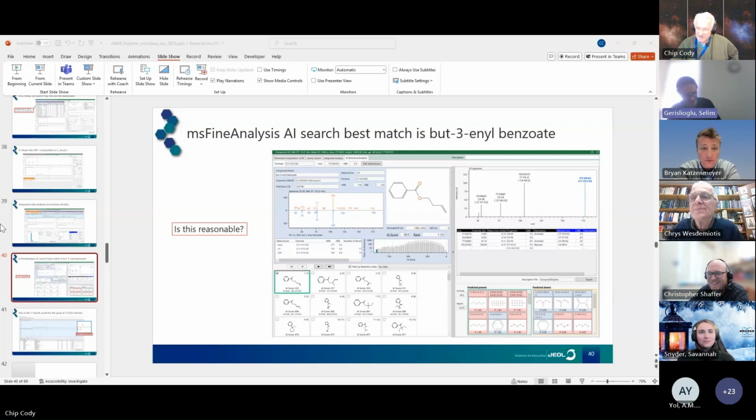Hello, can you hear me? Yeah, go ahead. Just one quick question. Very nice talk, I learned a lot. Thank you. And the mass spec repeat finder, is that software only applied for JEOL data, or can it work for data from other vendor instruments?